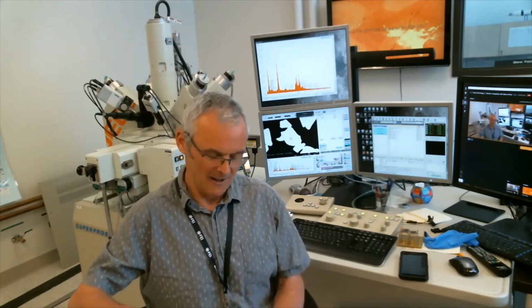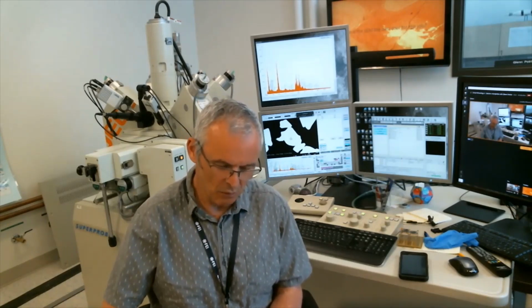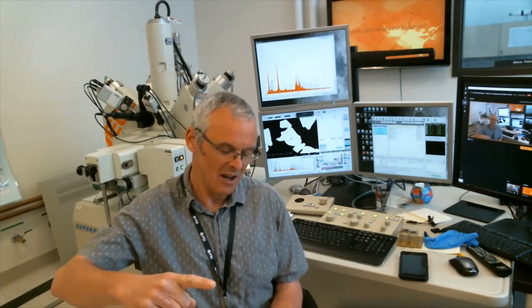So what happens is an electron from a higher energy level, like an L or an M, will drop down to fill that K shell. Because it's got a higher energy, as it drops down to that K, it's got to get rid of some of that energy. And what we're interested in is when it gets rid of that energy in the form of an X-ray photon. And the energy of that photon is very characteristic of where exactly it falls from and to.